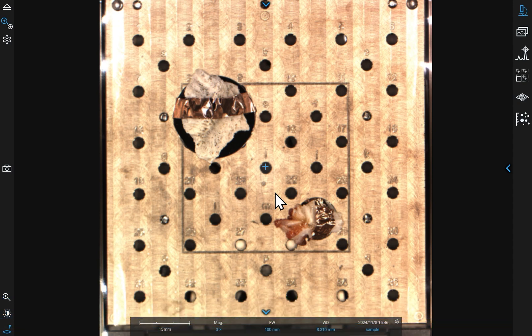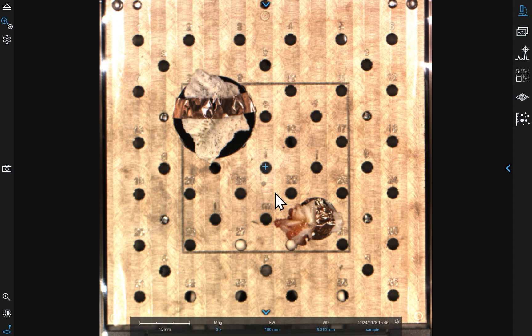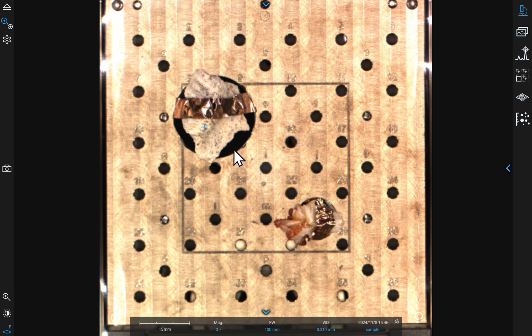The optical camera shows the sample stage, which you can use to navigate and choose a location. When you've selected a region on your sample with the blue crosshair, simply click the Move to SEM button in the top left corner.